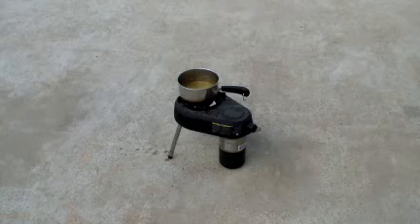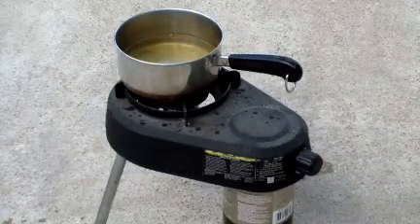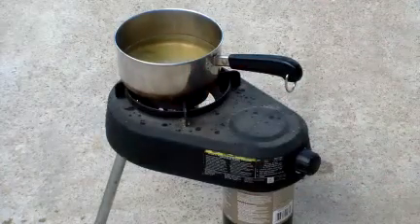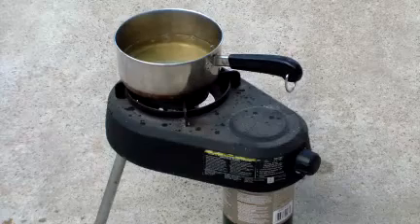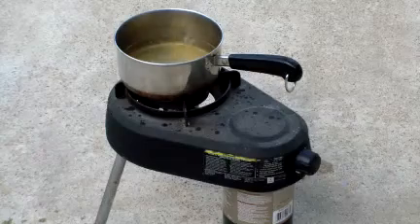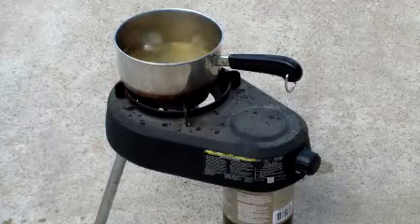Now you can see not just the bubbles forming at the top, but I guess it's kind of hard to see here. There is a bit of a reaction beginning. And what I need to do is I need to get this to a low simmer.